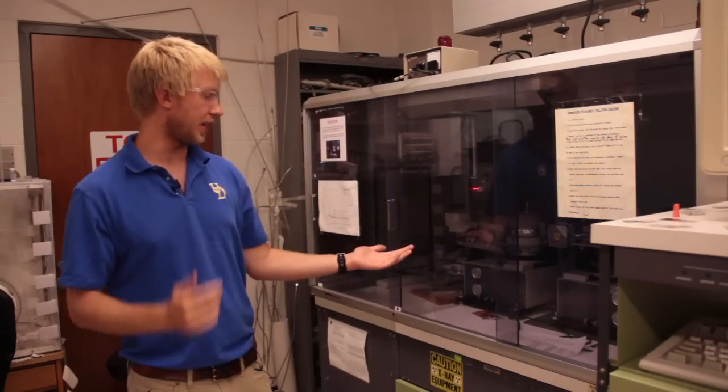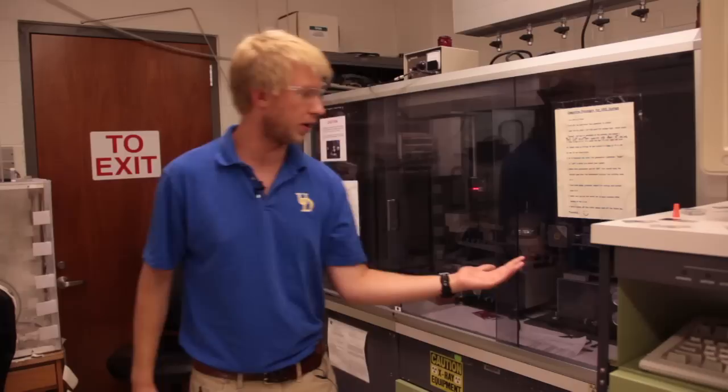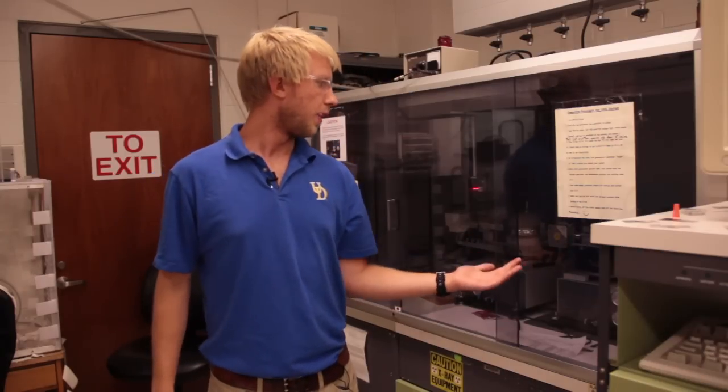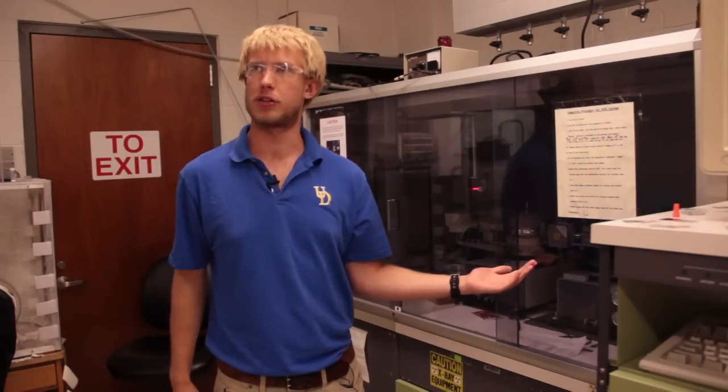This XRD machine has two halves. This one we use primarily for probing really any crystal structure. I use it to probe P3HT, PCBM solar cells.